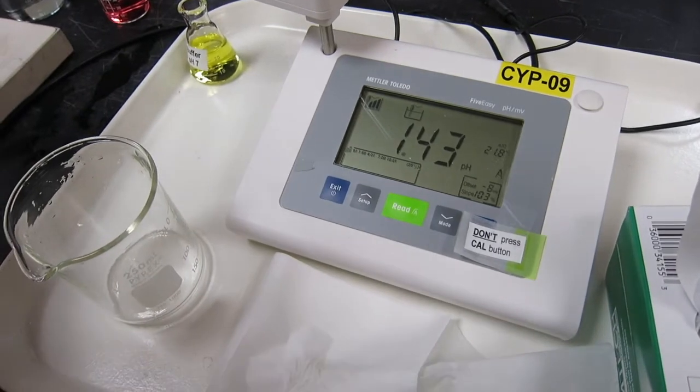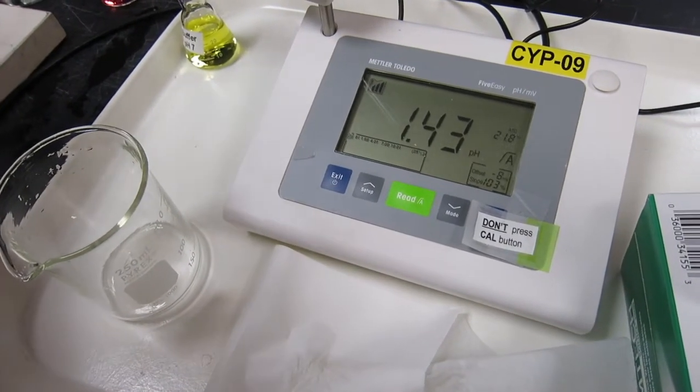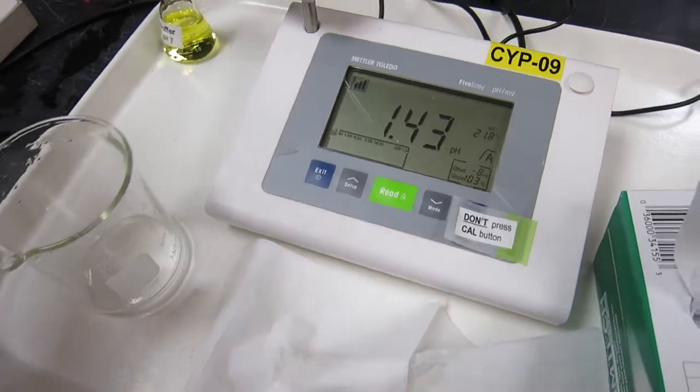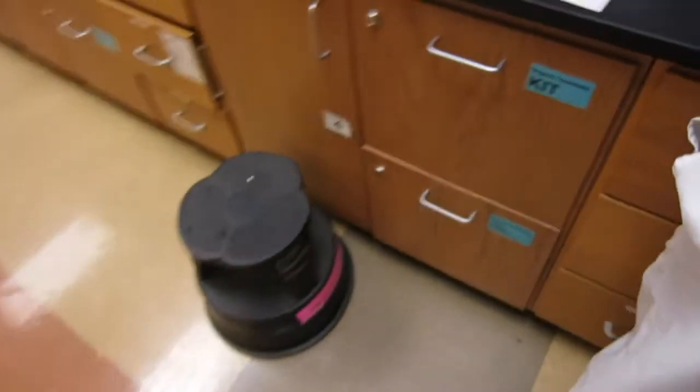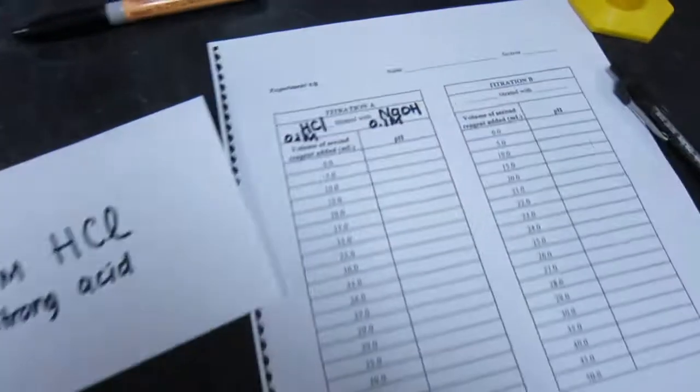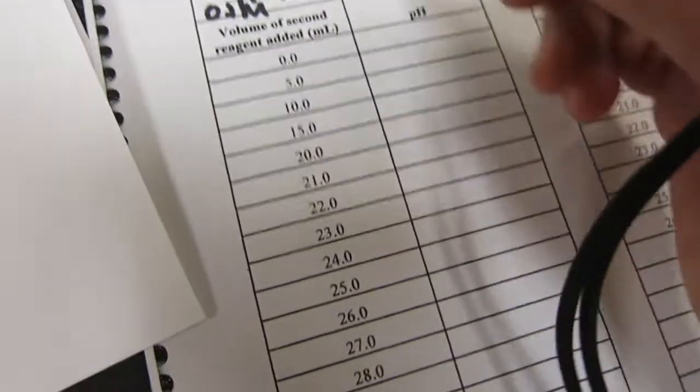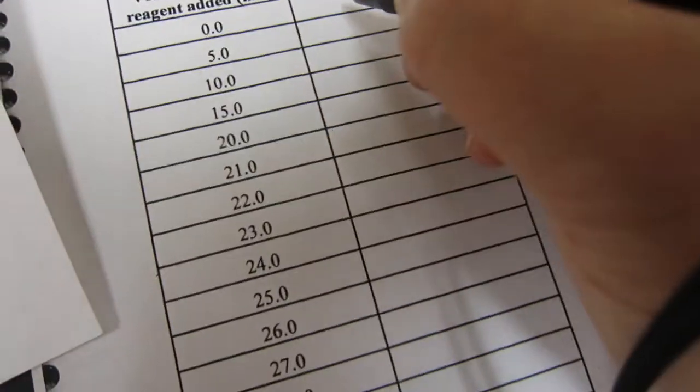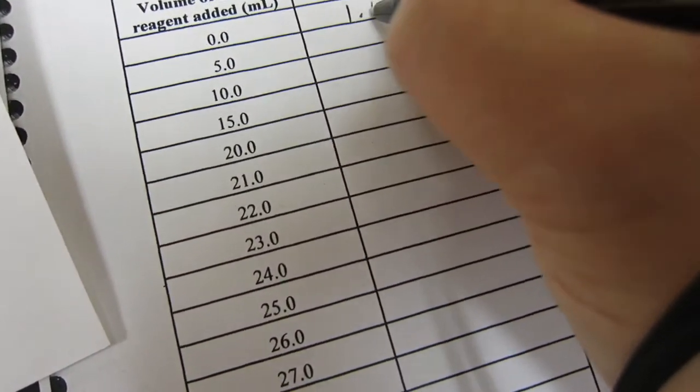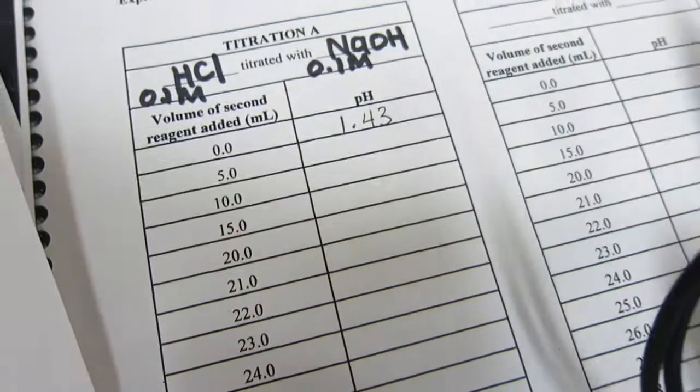I press it back to auto. There you go, it's 1.43. Back to your form, we fill in, so this is 0, and then we put 1.43 here. There you go.